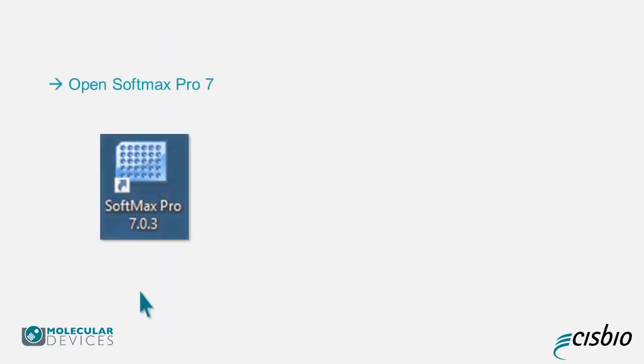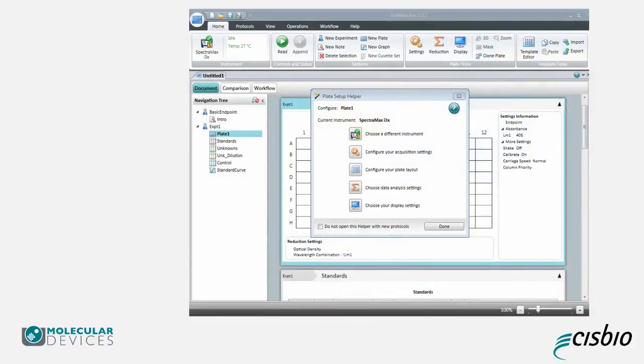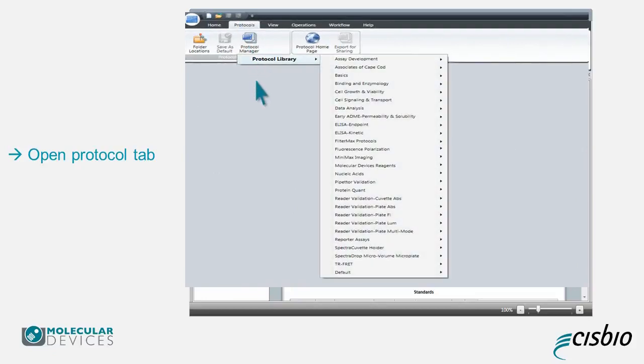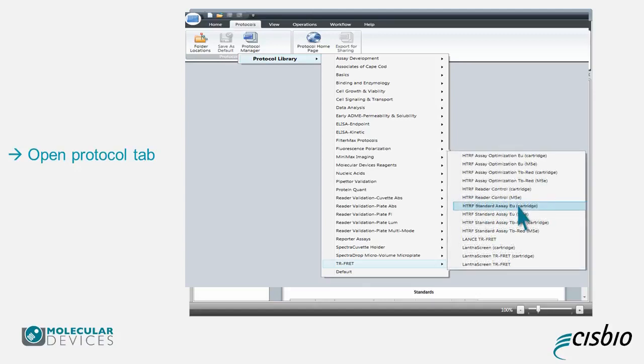To begin, open the reader software by double-clicking the Softmax Pro icon on the desktop. Once it opens, close the plate setup helper and click on Protocols. Using the Protocol pull-down menu, first select TR-FRET, then select HTRF Standard Assay Eu Cartridge.